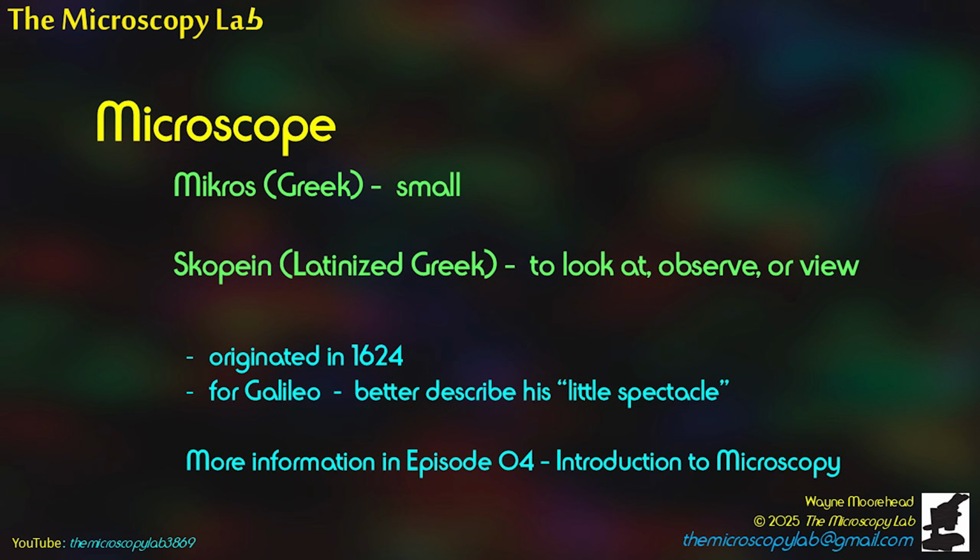The word microscope comes from the Greek word mikros, meaning small, and scopein, a Latinized Greek, meaning to look at, observe, or view. The word actually originated in 1624 specifically for Galileo so that he could better describe an instrument he called his little spectacle.